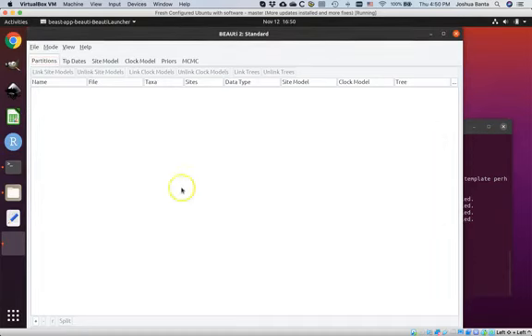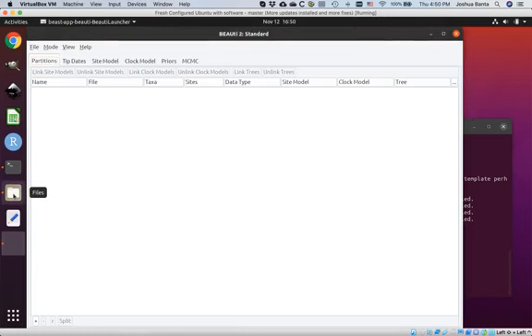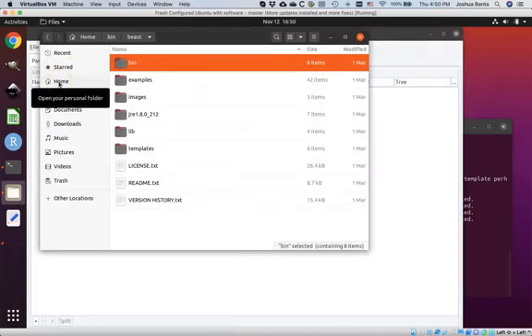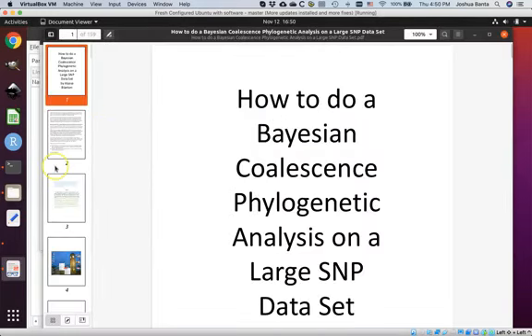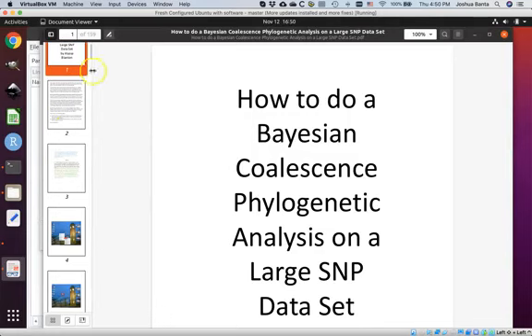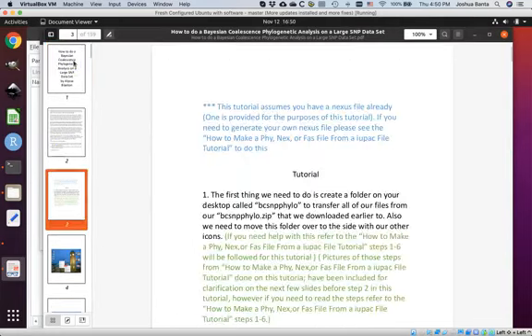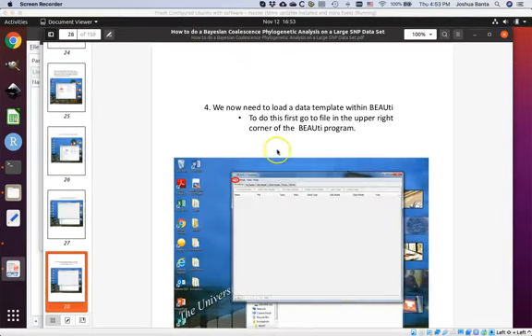Come back to your file explorer window and navigate back to your desktop. Double-click on BC-SNP-PHYLO. Now follow along with the document version of this tutorial designed for Windows. Double-click on 'how to do a Bayesian coalescence phylogenetic analysis' and keep it open. I've already gotten you to step four — not page four, but step four. Step four begins on page 28, and you can carry on from there.